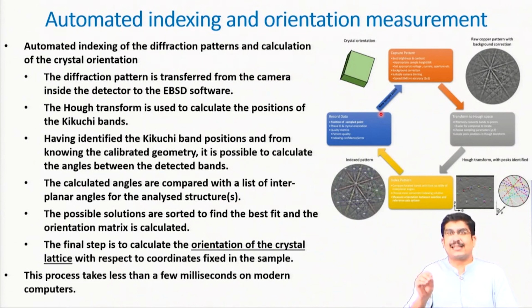Okay, and this entire pixel process you can do these days in milliseconds. So a large area containing millions of pixels will not take more than a few hours. When I started my journey way back in 2006 doing EBSD, data like this with almost a million pixels would take days for a scan. These days, with faster detectors, software improvement, and computational power improvement, you can do it in a few hours itself.